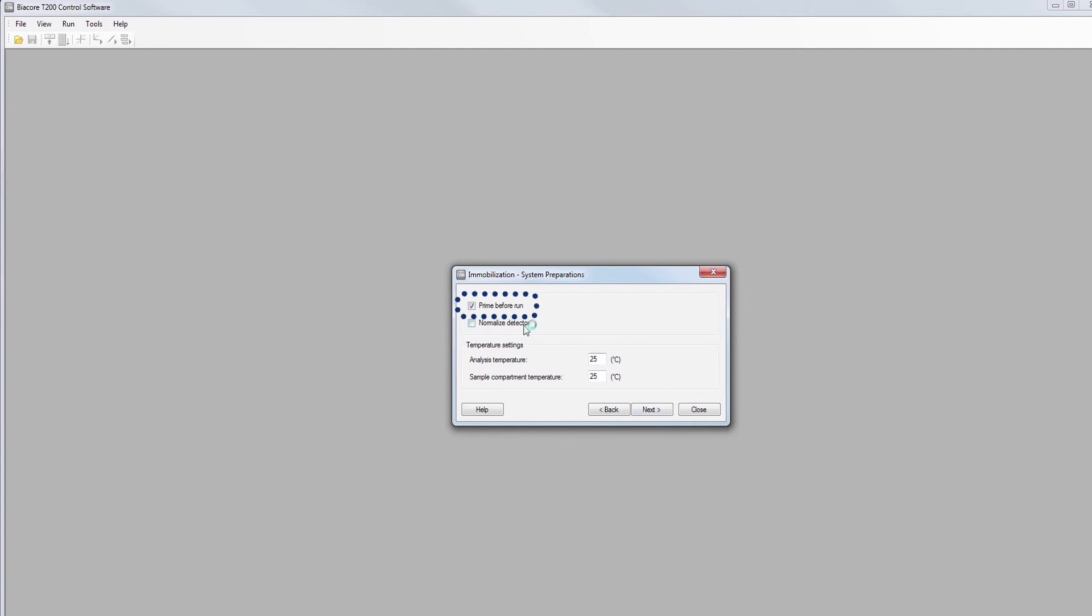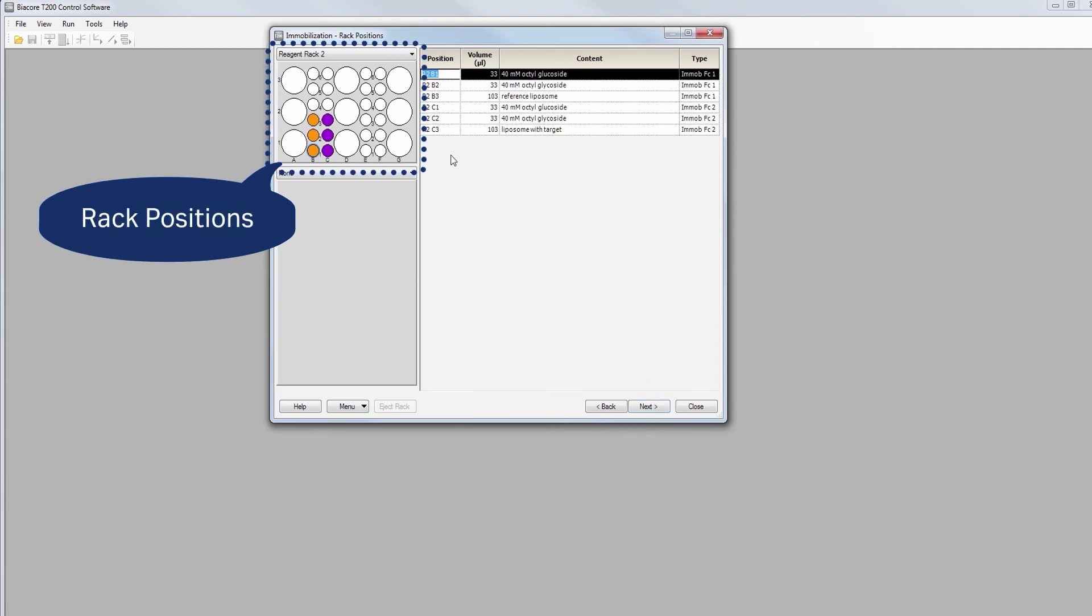The system needs to be prepared with a prime, with detergent-free running buffer. The default position of reagents can easily be altered.